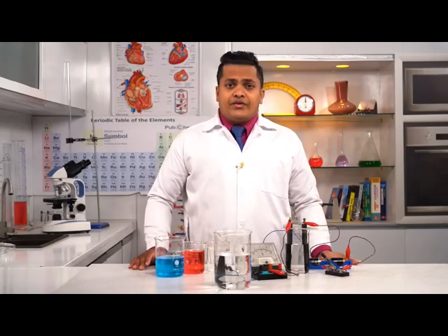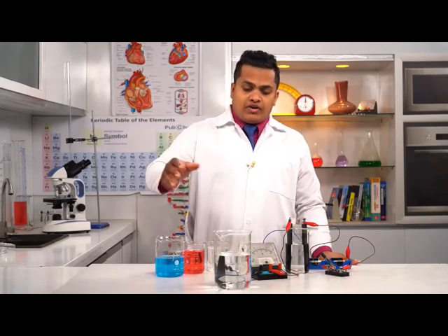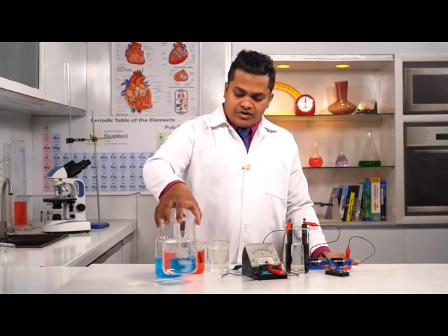Distilled water means there are only water particles in it. There are no other compounds. There are no other ions. It's not like mineral water that contains several minerals. This is distilled water. So it contains only water particles. Remember it.